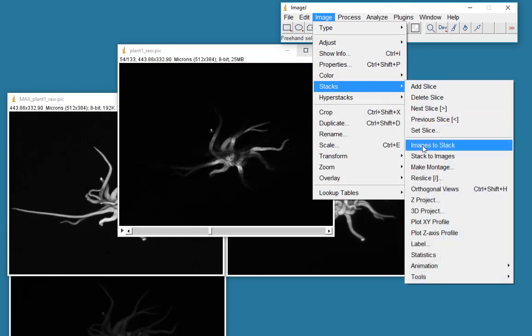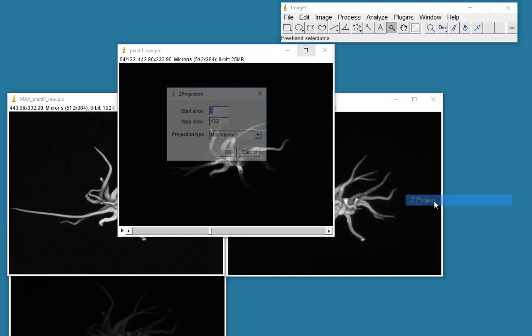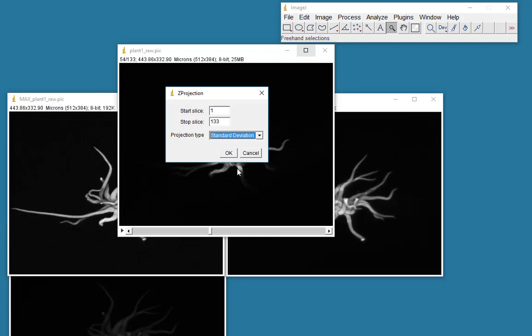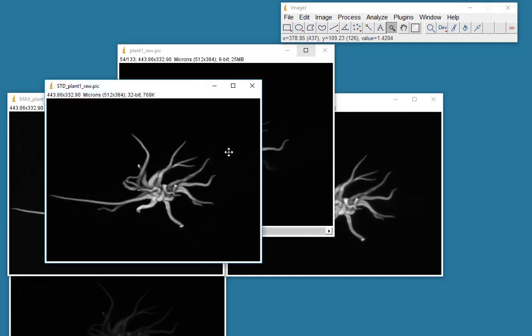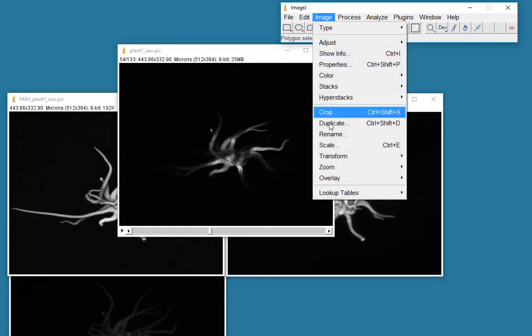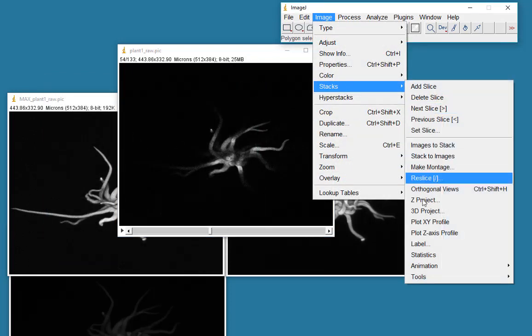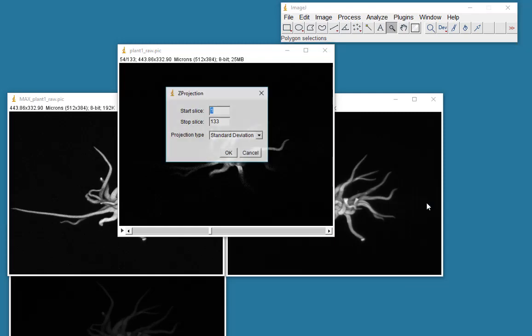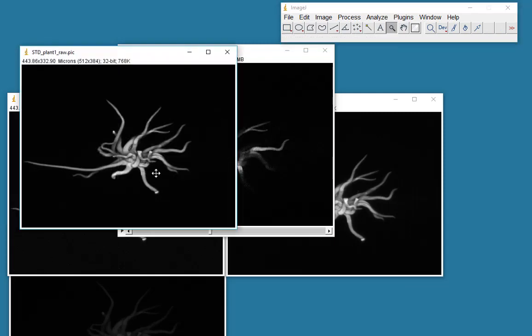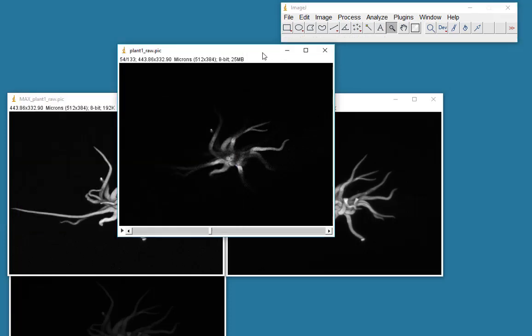Or we could try a standard deviation. So we'll do a Z projection. And this is the standard deviation of taking from the average of all the slices. Actually, it looks not too bad. Let's just check that was a standard deviation. Stack and Z project. Yeah, standard deviation. It's quite nice. This image looks quite smooth.